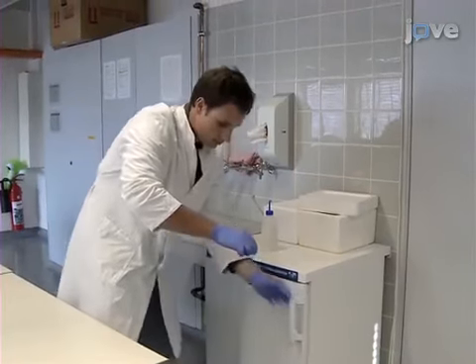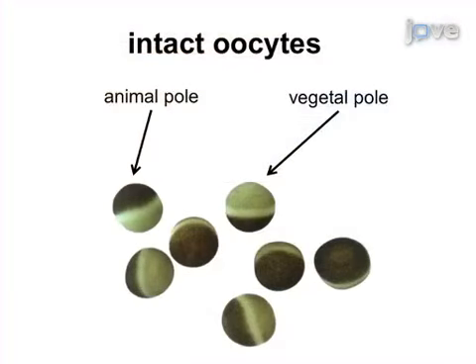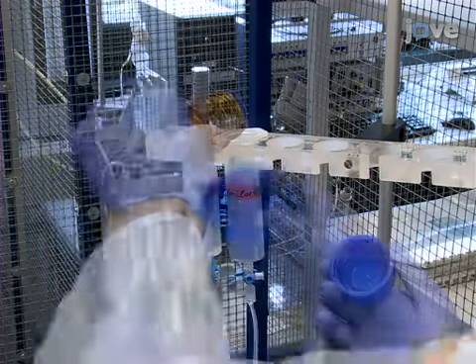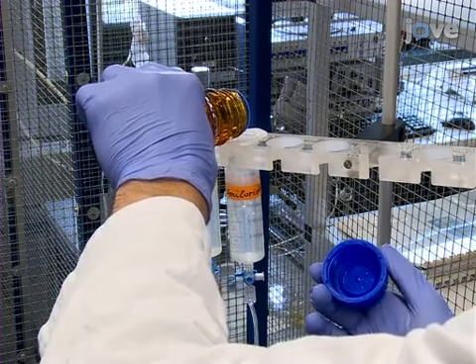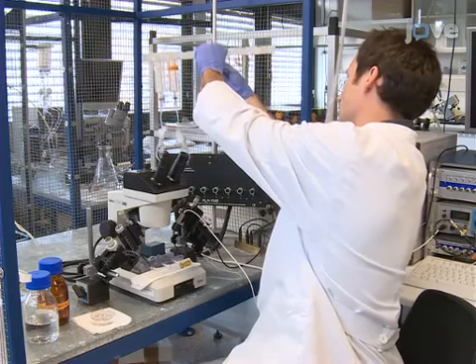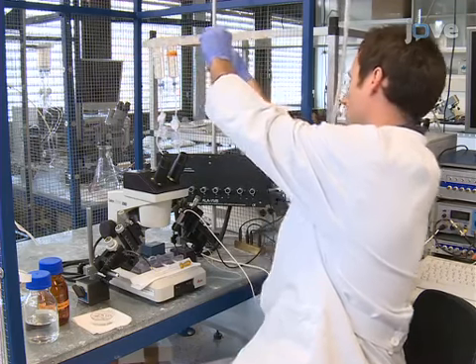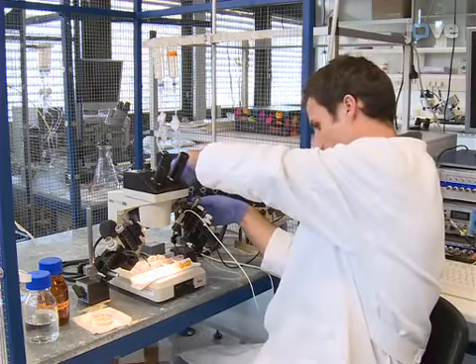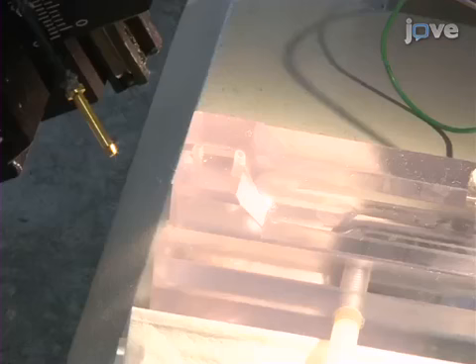Two days after isolating Xenopus laevis oocytes and injecting with cRNA according to the text protocol, use ND96 to fill one syringe of a gravity-fed perfusion system and ND96 containing amiloride to fill a second syringe. After mounting the syringes 50 centimeters above the bath chamber, turn on a 150-watt halogen cold light source and adjust it to 10 centimeters above the oocyte bath chamber, allowing good visualization with the binocular microscope. Turn on suction and place the suction tube opposite the superfusion tube's adapter in the oocyte bath chamber.